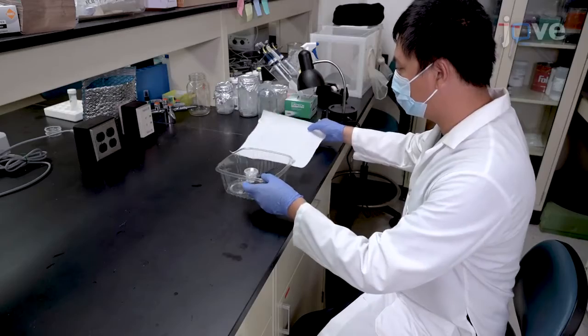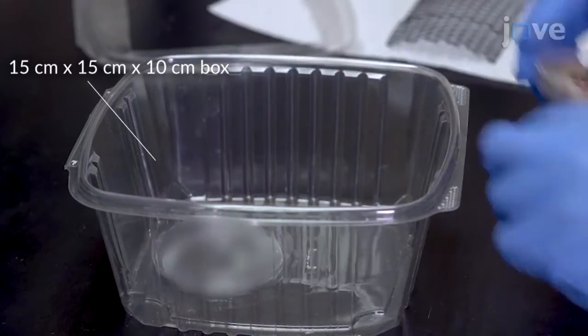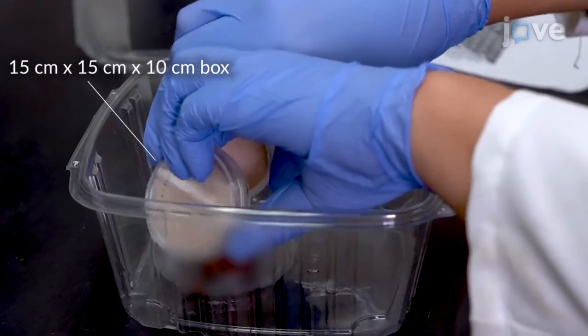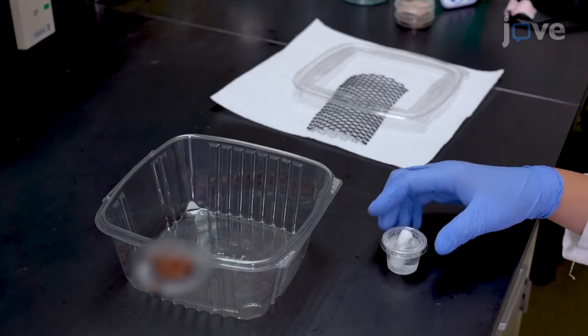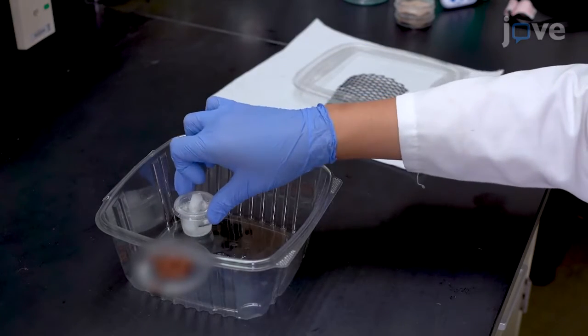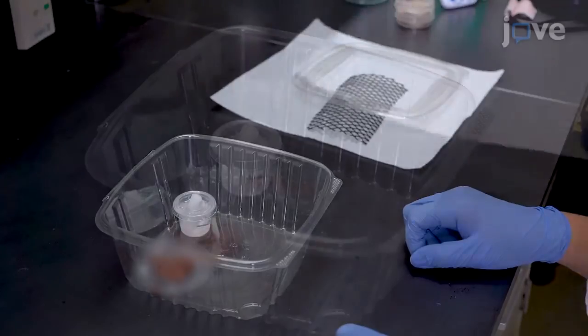Begin by placing 12 male pupae and 12 female pupae in a box. Place a 10% sucrose solution in the box for feeding adults. Cover the box with a paper towel.